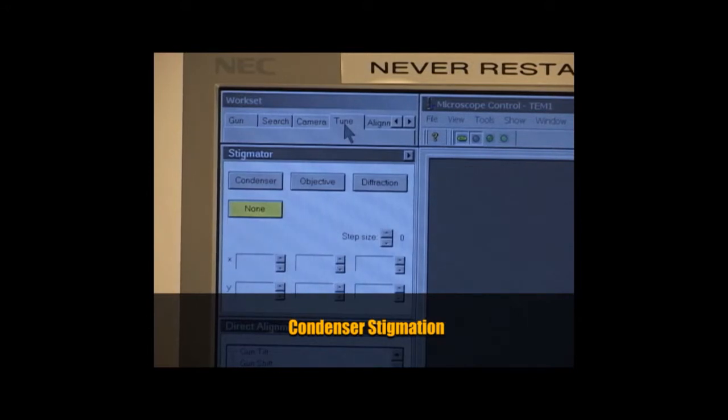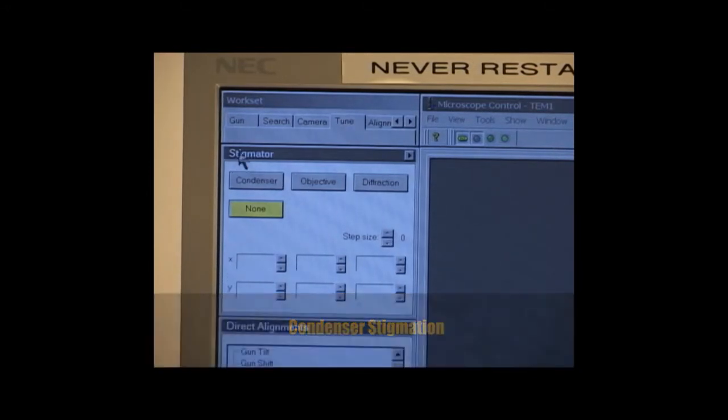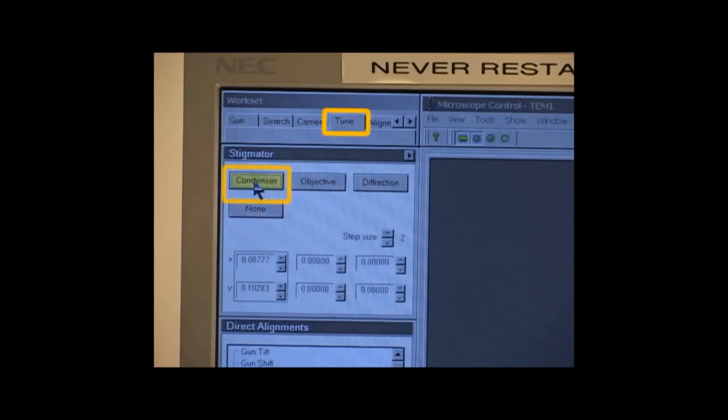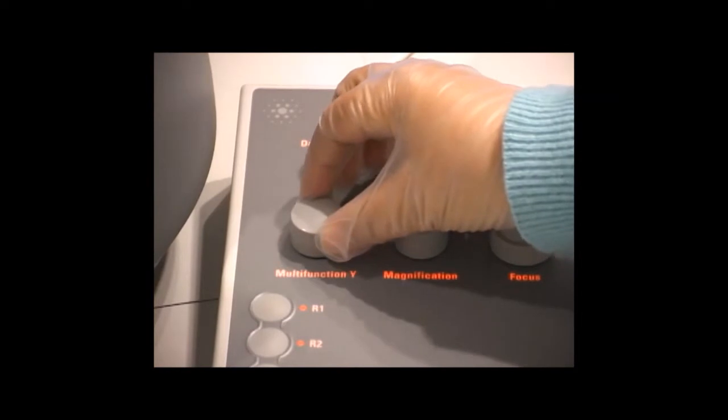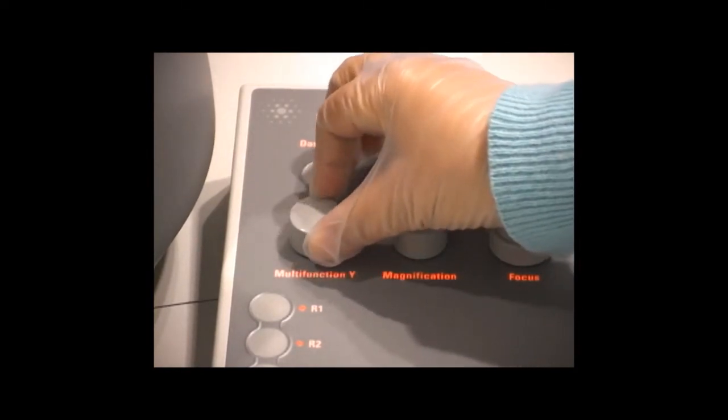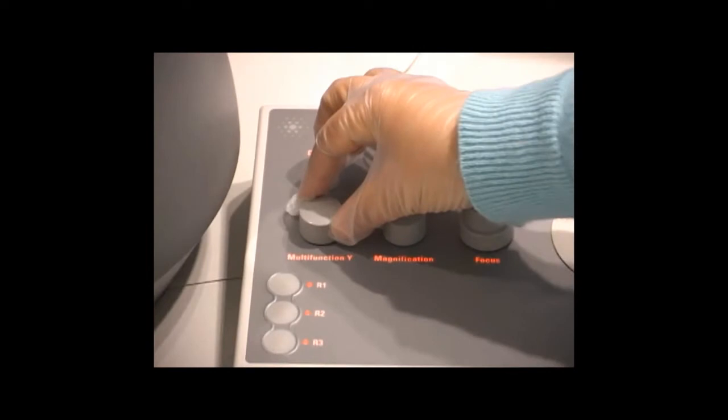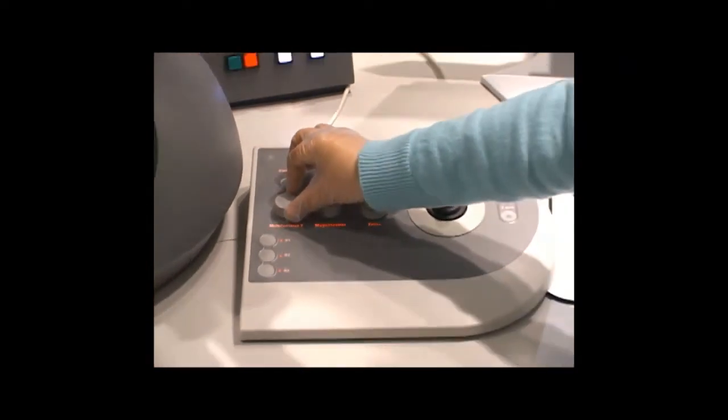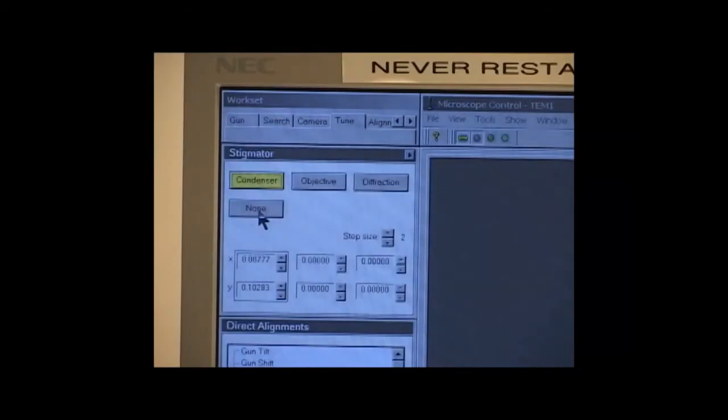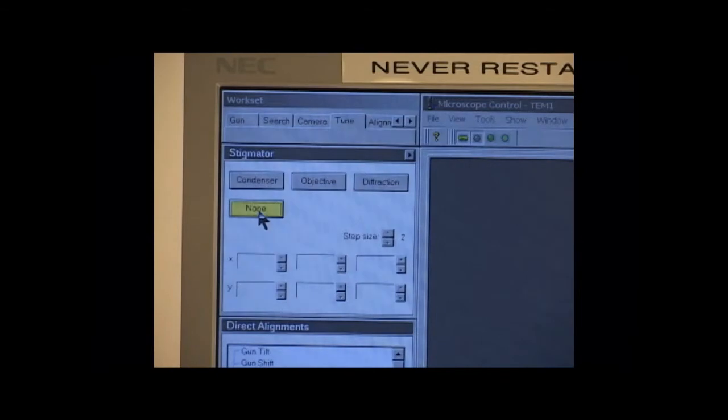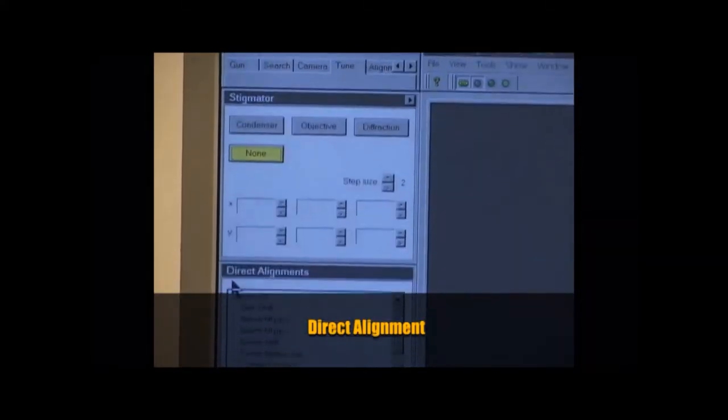Next, we adjust the condenser stigmation. Click on Tune and Condenser from the Stigmator menu. Use the multifunction knobs, MF, on either side of the scope to adjust the condenser stigmation in both X and Y directions to ensure the beam is round and expands concentrically. After you are finished, be sure to click None, otherwise the multifunction will continue to control the stigmation.